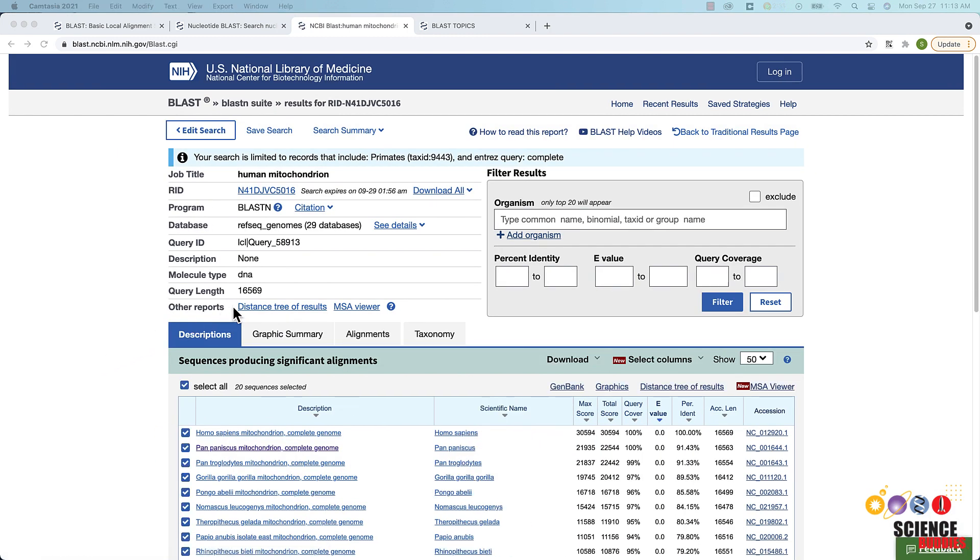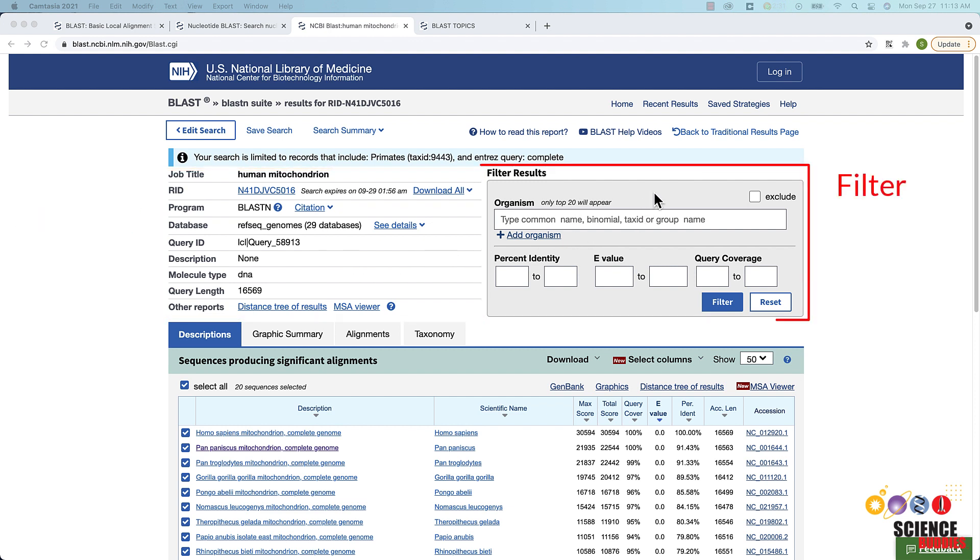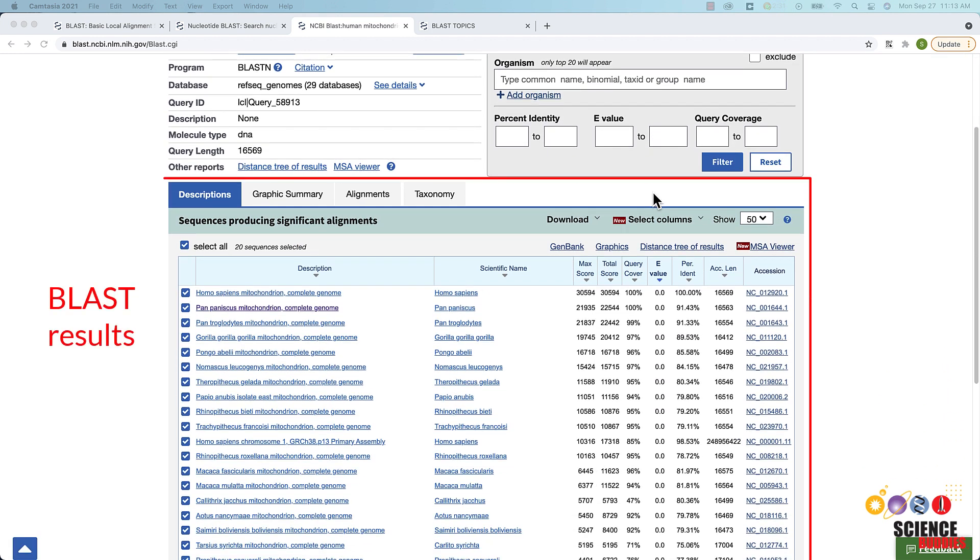On the top left of your BLAST report, you will find a summary section with information on different aspects of your search. On the top right, there is a box that allows you to filter your results based on organisms, percent identity or e-value.